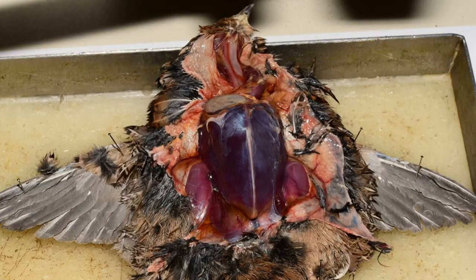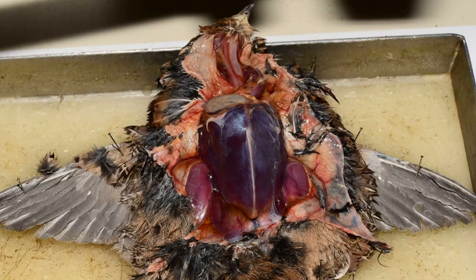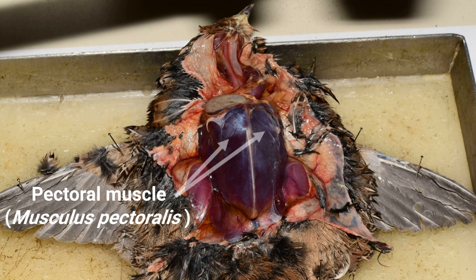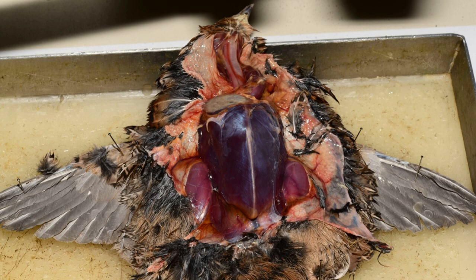The powerful pectoralis chest muscle rests on the sternum. These muscles pull the wing down. The supracoracoideus, which raises the wing, sits dorsal to the pectoralis, and is thus currently hidden. In addition, the sternum and the crop are now recognizable.